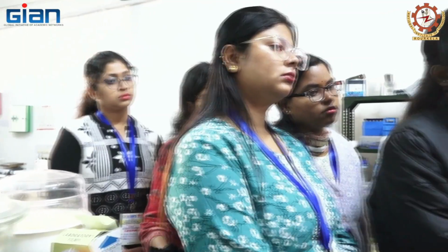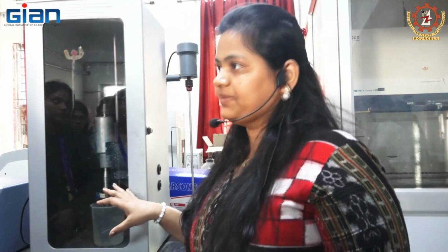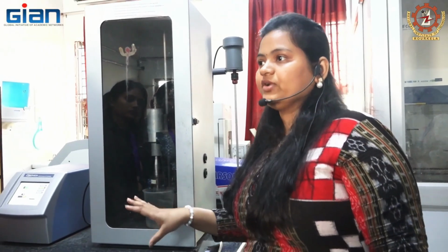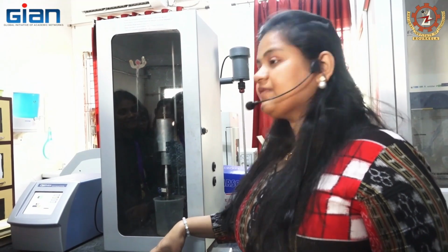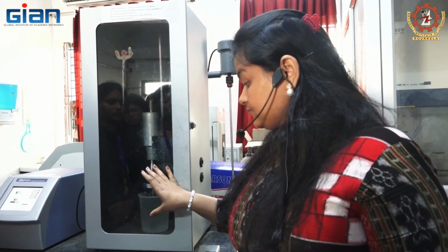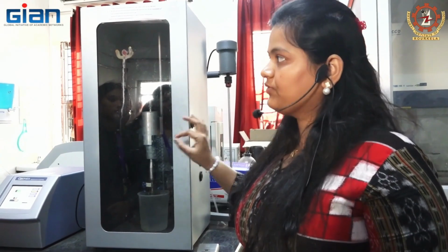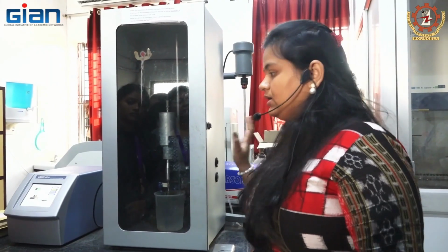because in lesser time, in 5 minutes, you can get a good amount of yield, whereas at 24 hours, 48 hours, the conventional extract does not give that much bioactive compound. Okay, then higher yield is there, lesser time, very minimum time you can get your results. Okay, because time is money. And the thing is it is environmentally friendly, any type of solvent you can use. Okay, and the versatility I have already told, any type of solvent you can use in the ultrasound. There is no effect by the equipment.